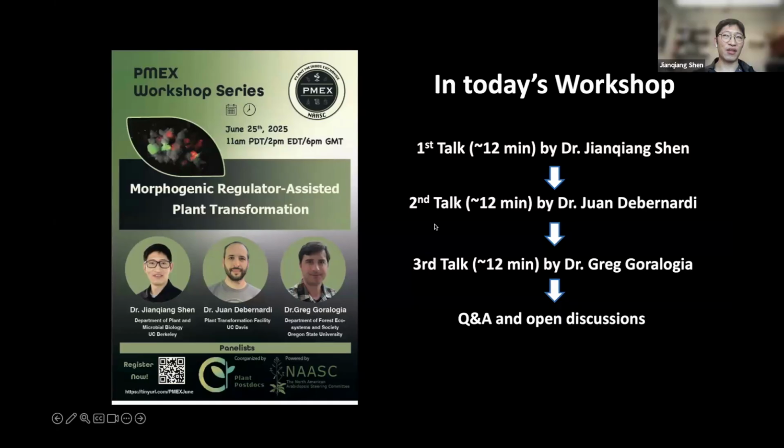In terms of chimerism, we have to separate two parts. One is the transformants being chimeric. The other is the editing being chimeric. Editing chimerism, we also talked about it, and we would probably use genetics to filter it. For transformant chimerism, typically, if we use morphogenic genes and start with a low transformation efficiency, the somatic embryo induction would automatically filter out a lot of chimerism.